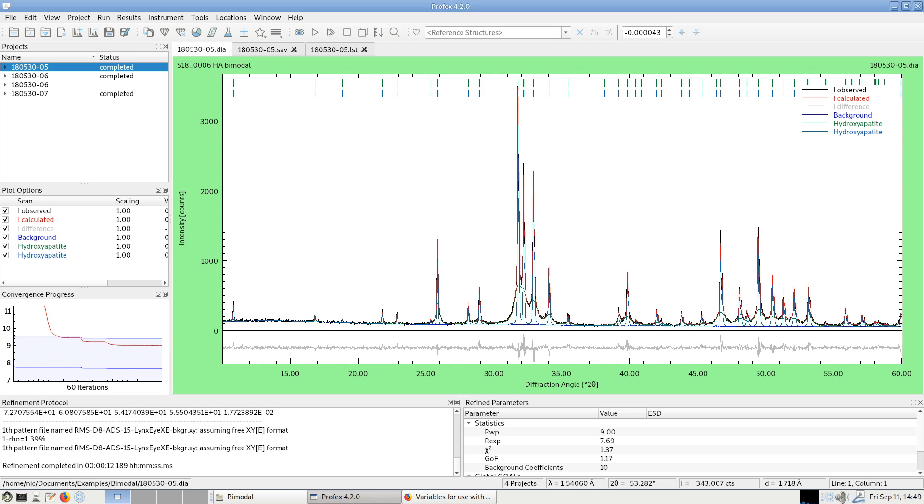However, if we add a second phase for the nanocrystalline fraction of each phase, we double the number of phases and also the number of refined parameters. In samples with multiple phases and a fine fraction of each phase, for example because the powder was overmilled with a high intensity mill, this can lead to an unstable refinement.